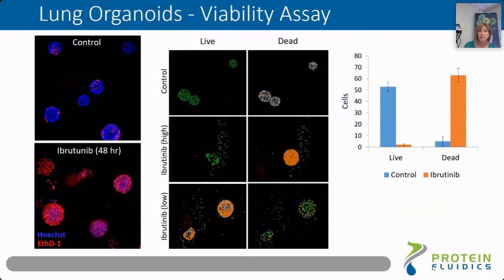The analysis was done here using MetaExpress software. And then this data is translated into this plot where you can see that clearly upon exposure to the treatment, we can see substantial cell death and substantial cell killing compared to the untreated control.